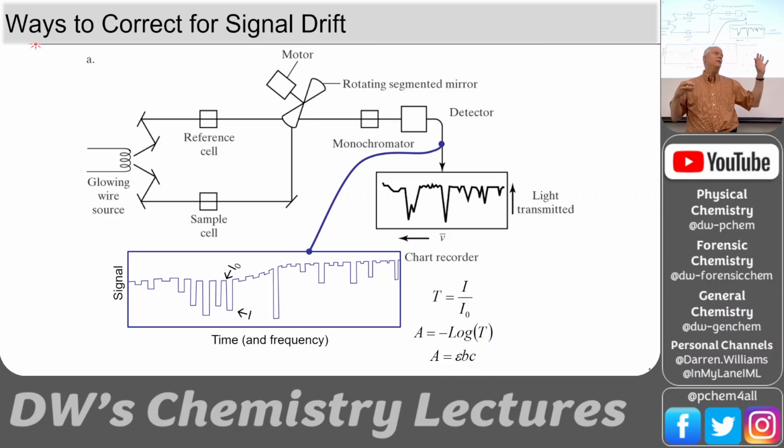That's drift. Okay, so your spectrometer in a single beam thing where you got a single beam, you put the reference in, adjust it, take it out, someone gets in the elevator, you put your sample in, the dimmer light source is misinterpreted as a higher absorbance, okay, or lower. Maybe your blank is in there while somebody's coming up to the 3rd floor. You take it out, the beam gets brighter, you stick your sample in, and now your absorbance is lower than you expected. So on your calibration curve with a drifty instrument, it's got points that are up and down in bad ways. Okay, there are other things too that can cause trouble with drift.